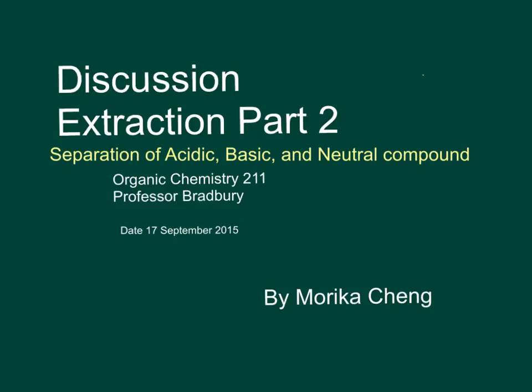Discussion for extraction part 2. The separation of acidic, basic, and neutral compounds.